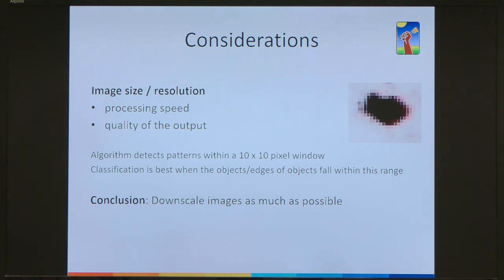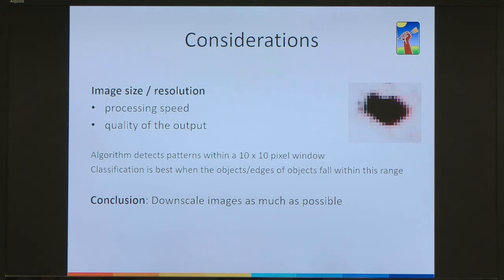One important consideration when doing classification with Elastic is that the resolution of your image has quite a big impact on both the quality of the output and processing speed — the bigger the image, the slower the processing time. Ideally, it's best to resize your images so that the objects or edges of objects fall within the 10 by 10 pixel window, because if outside this range the program won't be able to detect them. My recommendation is to downscale as much as possible without losing the information you're interested in.